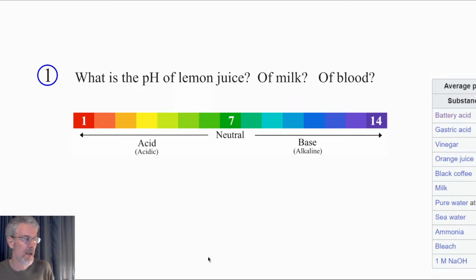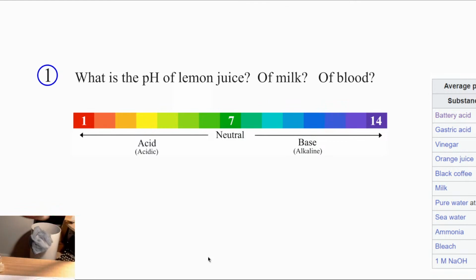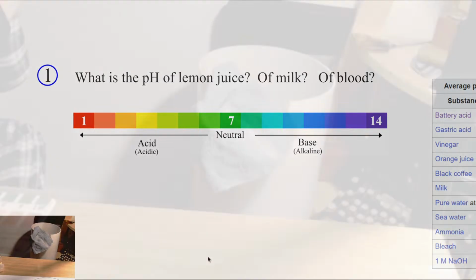So I'm going to move my camera over, and I have some pH paper. Let's actually test this. See if I can move my camera over here. I think I can do it. It's a little bit challenging. I need to get another camera. I need to get a really nice other camera here so I can just switch back and forth. All right. There we go. So this is probably the best I'm going to do this evening for you here.